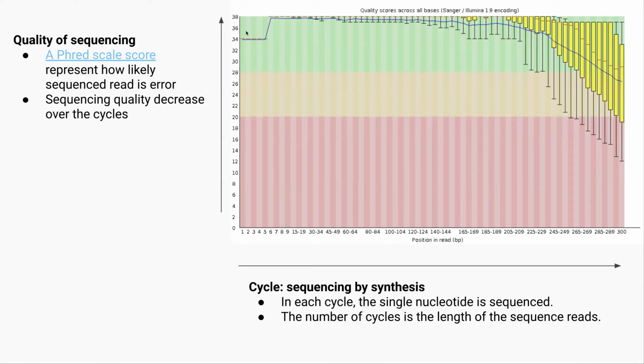And another thing is just a tiny piece of information, not really important. Some students might ask, Professor, why do the first few cycles have lower quality than these later steps? Because in this process, they are adjusting the cluster position, right? So they don't have the prior information. So they adjust the quality in this process. That's why it's artificially a little bit lower quality than the later parts. Okay, so that's the basic thing.